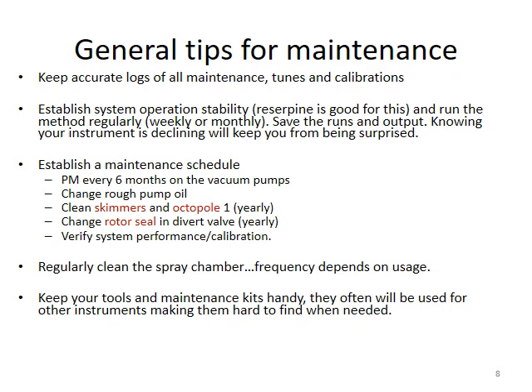Logically, you should keep the logs of all maintenance, tunes, and calibrations. And you don't have to worry about this. Usually, for all the software, they should have an add-on called daily logs. It will keep track of all the maintenance, tunings, and calibration that has been done to your instrument.